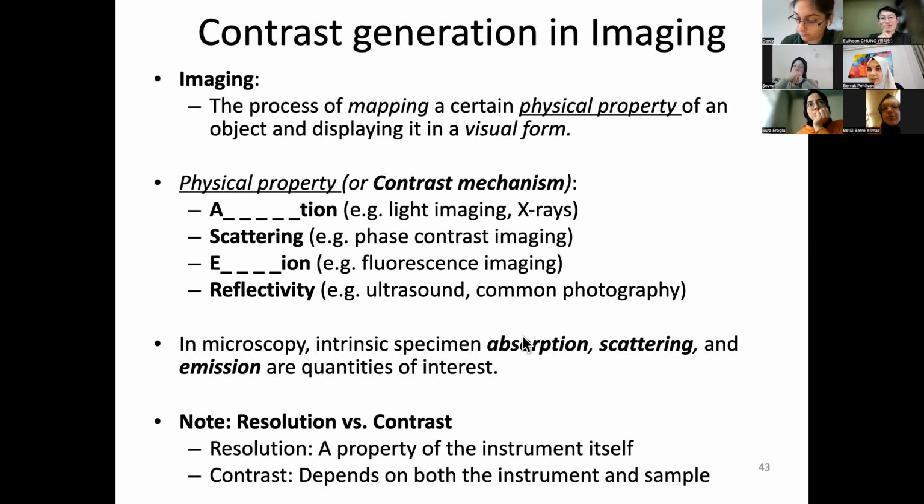Oh, exactly, true. So my answer is, for H&E, like conventional stained microscopy, you are not using fluorescence. In that case, you are using absorption of the light that gives a color to you, let's say pinkish or bluish.